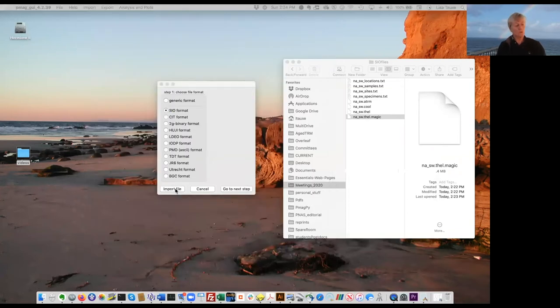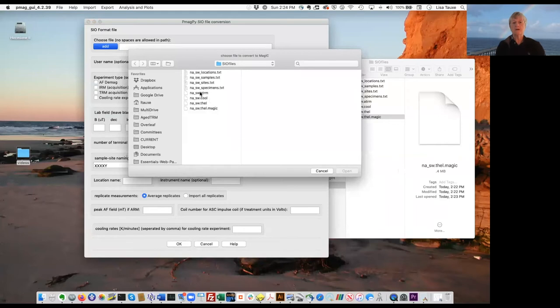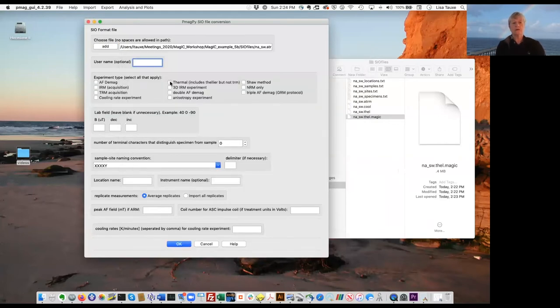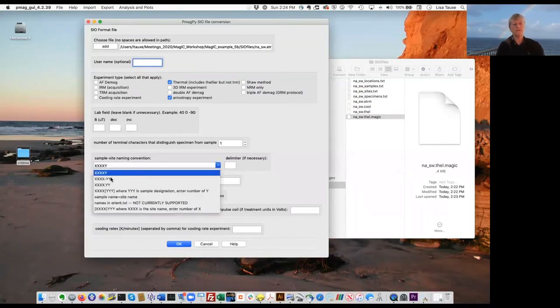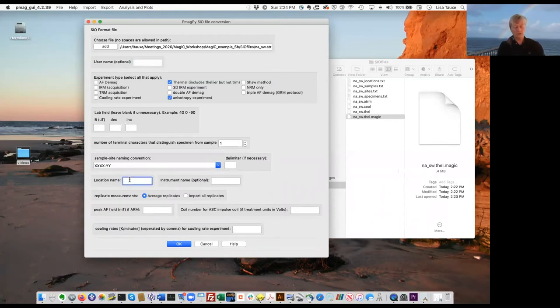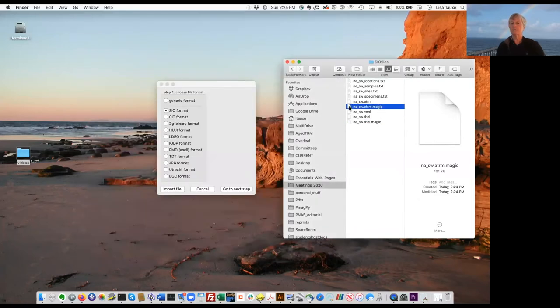We have two more files to deal with. The next one is the anisotropy data, so we add the ATRM file. This is a thermal anisotropy experiment. The lab field changes because it's an anisotropy experiment done in six different positions, so I don't need to fill that in. The terminal specimen and specimen-sample-to-site convention is the same as before, and the location name is the same — four corners. PMAGPIE GUI created our ATRM magic file.